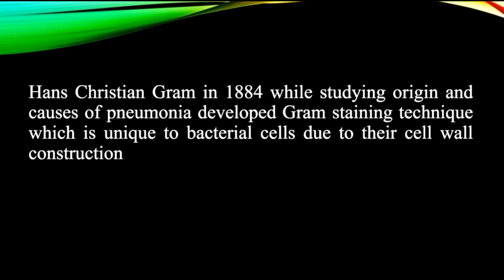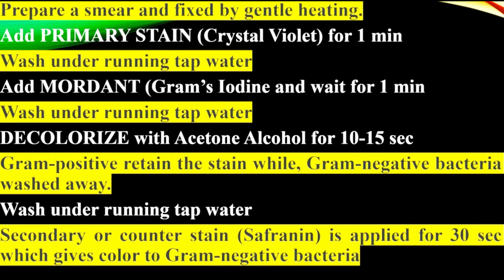So, in 1884, Hans Christian Gram, while studying the origin and causes of pneumonia, developed a stain which is called gram staining. So, the gram word is from Christian Gram. The stain is unique to bacterial cells due to their cell wall construction.